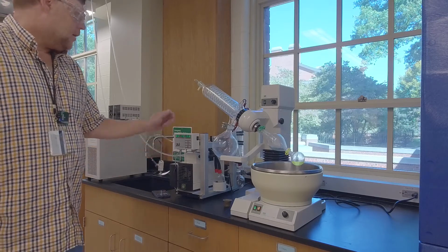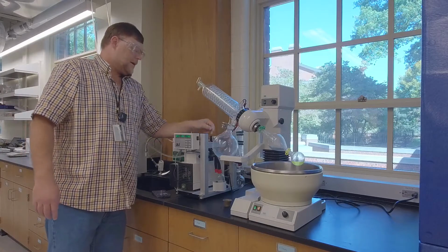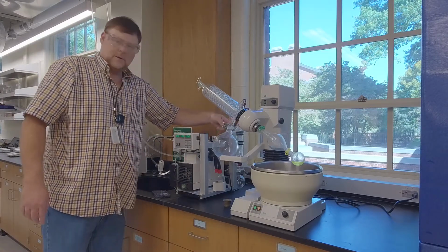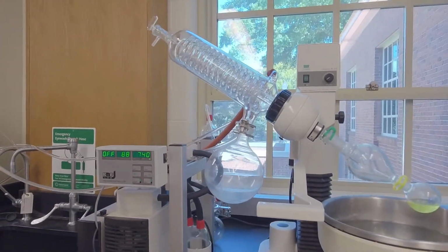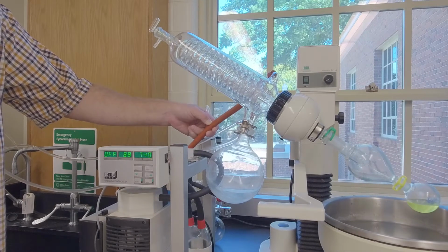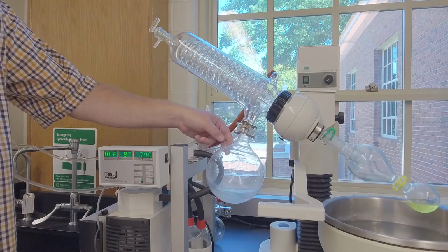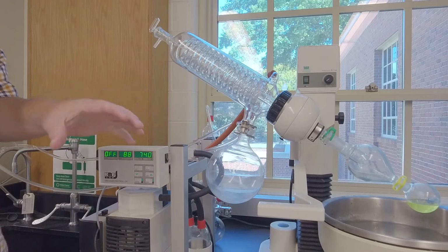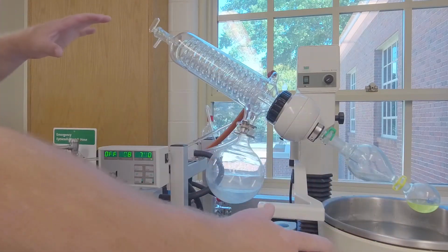And then I'm going to hit the, oh, okay. So the vacuum is going to be generated and come through this heavy walled line, the red line. Let's get this a little closer. All right, so the red line here, this heavy wall tubing, so it can take a vacuum. This thinner wall tubing, you pull a vacuum through it and it's just going to shrink up. That will allow us to evacuate this entire mess here, right? All the glassware is going to be under vacuum.